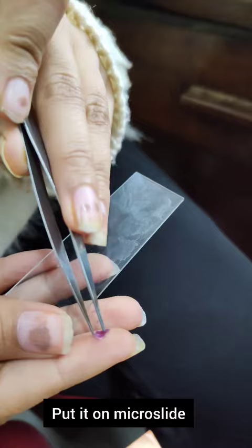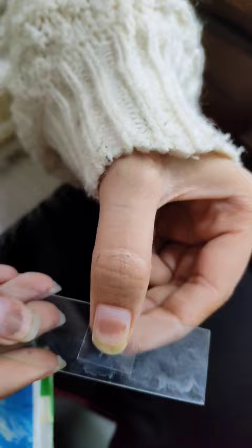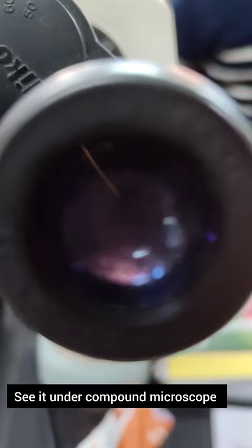I borrowed the fork from my friend, and then placing it on the slide we can see it under the compound microscope. As you can see, there are numerous stomata with guard cells and turgid purple cells.